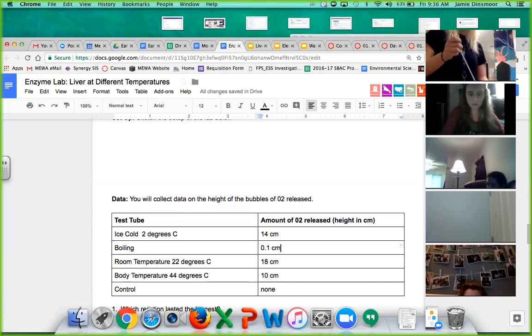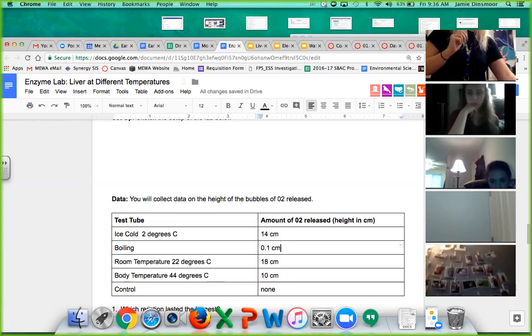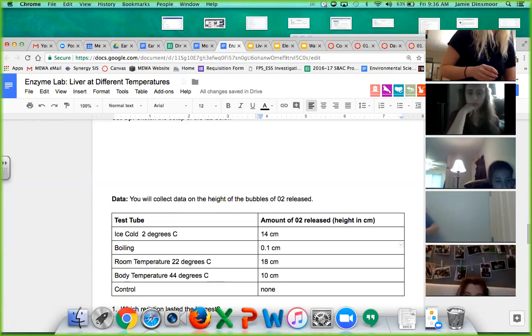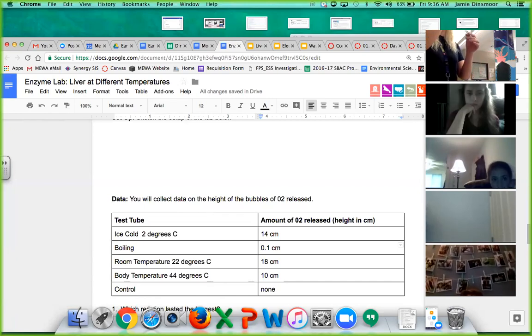And then we will start talking about the conclusions behind this, and then we're going to prove that oxygen is here. Or actually, I thought we were. I might have to find a lighter to do it, though. We're going to use fire to do it. Okay. Oh, good. This liver is a little bit closer to body temperature at 39 degrees. I'm going to let it sit in there for just 1 second.